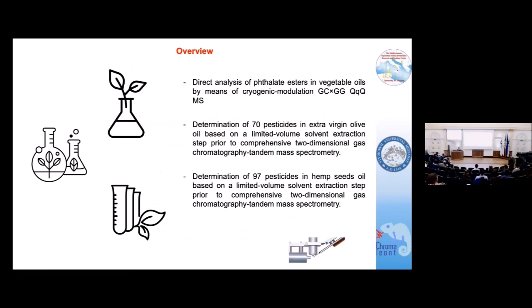Today, I show you 3 different applications. Probably some of you already know the first one because I already presented part of this one in the previous meeting. However, just to show you the evolution of our approach. So I show you 3 different methods for the analysis of phthalates in vegetable oil and pesticides in extra virgin olive oil and also in hemp seeds oil.